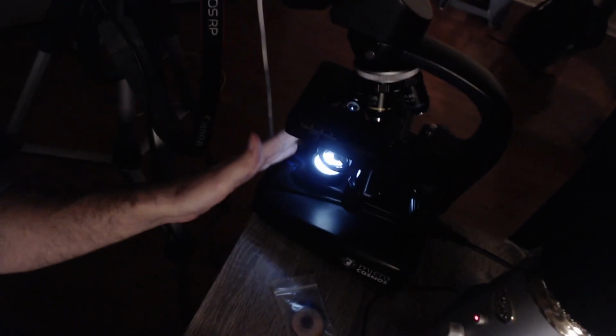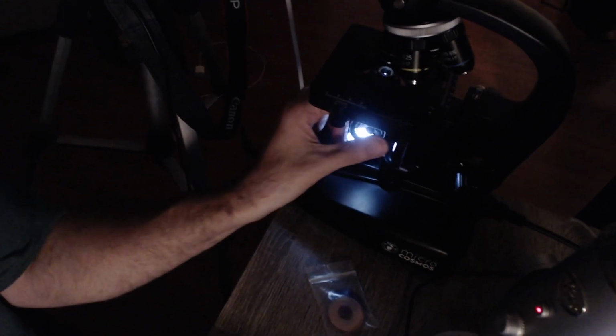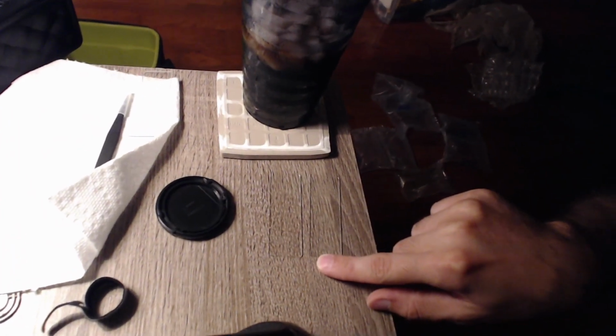Okay, so we've got our microscope right here. Here's the oblique illumination filter that I just swing under there, and I have different filters on the other side of this desk. Here are the two slides we just looked at. This was the one with the red water. This was the one where we saw the bacteria.